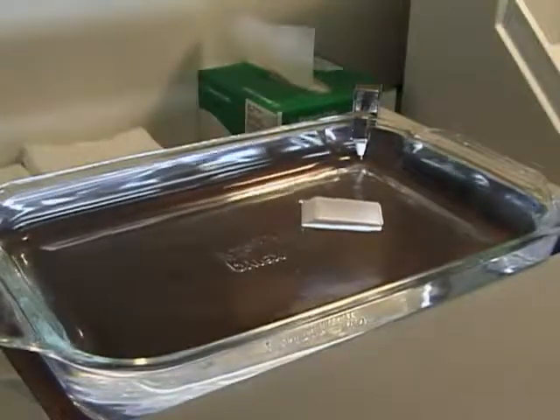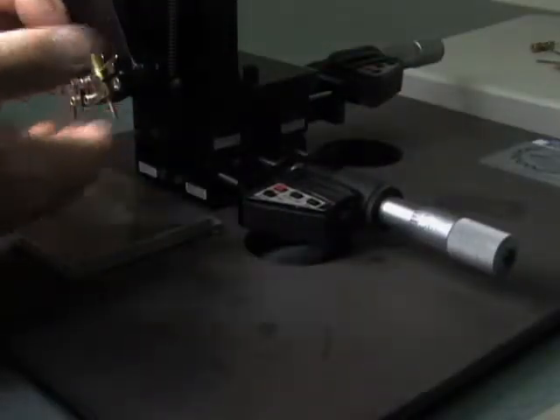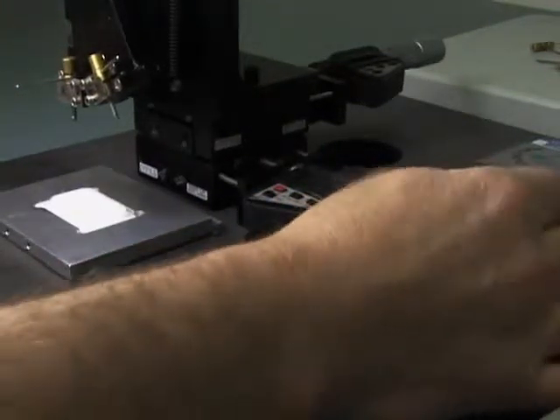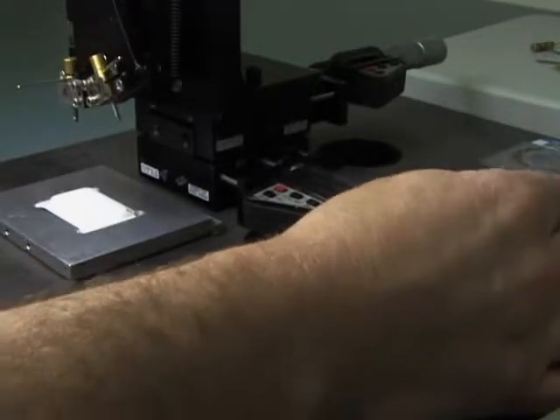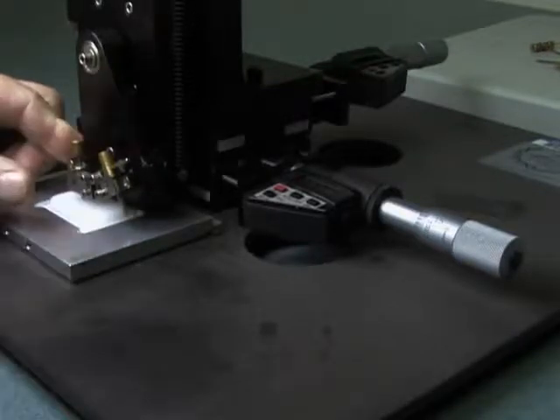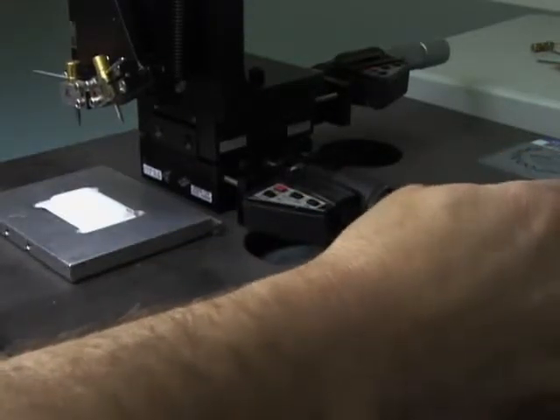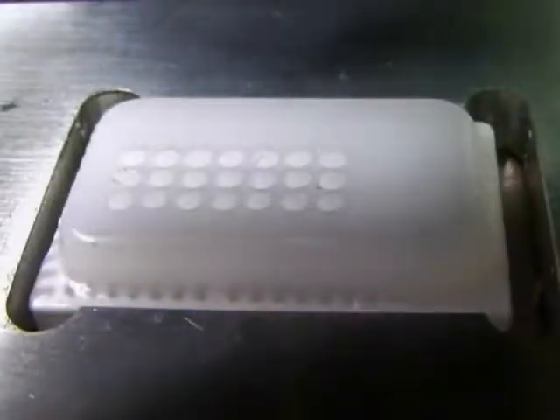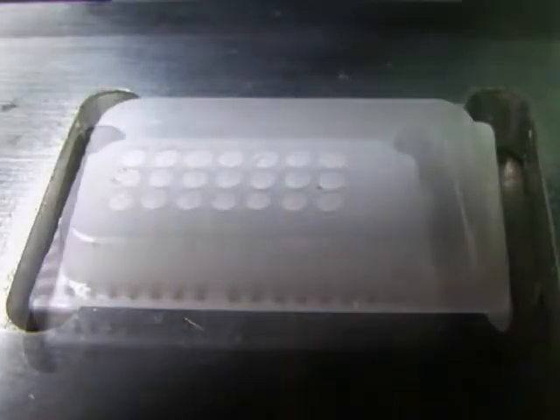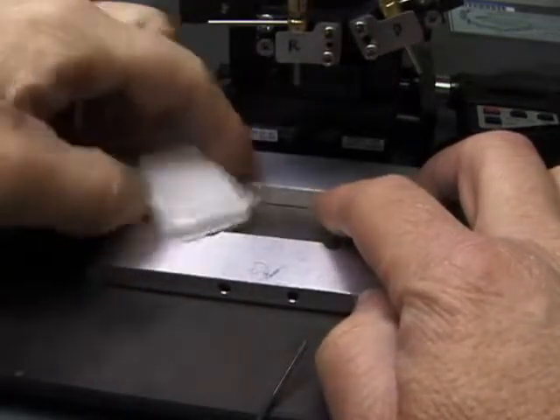Place the block again in a water bath to soften. Because the punches are considerably larger than the 0.6 millimeter needle, it's a lot easier to line the punches. A large paraffin block can have up to 60 punches without risk to damage. Flip the block once you have punched the first two-thirds. Align the needle and warm the block again.